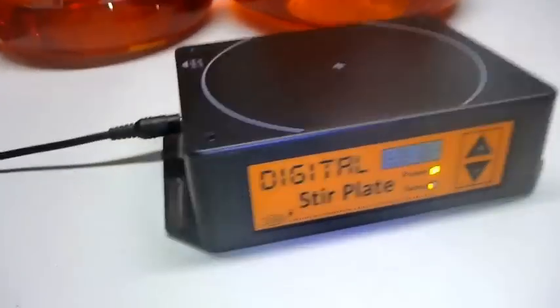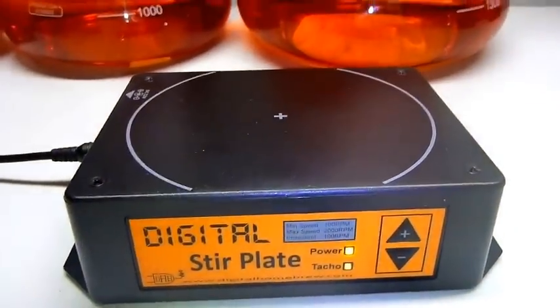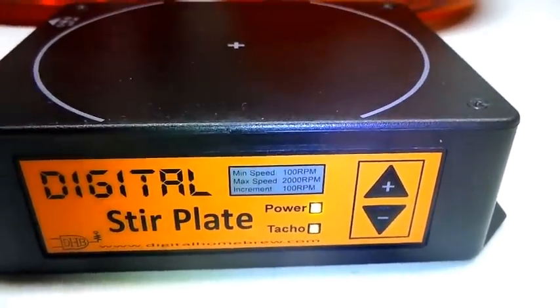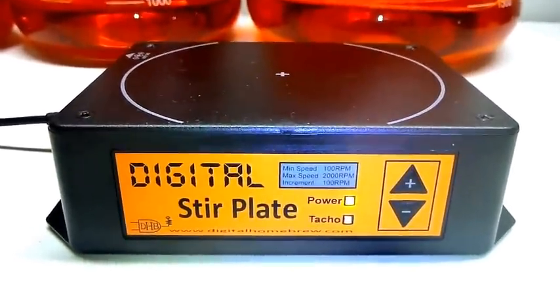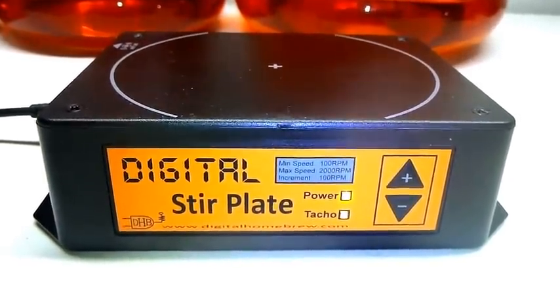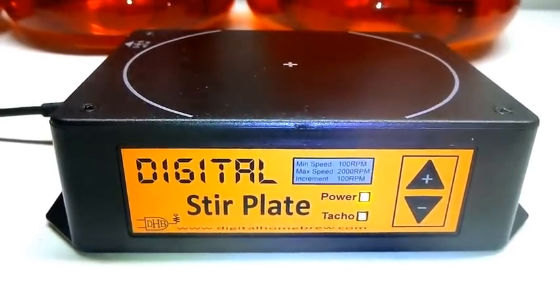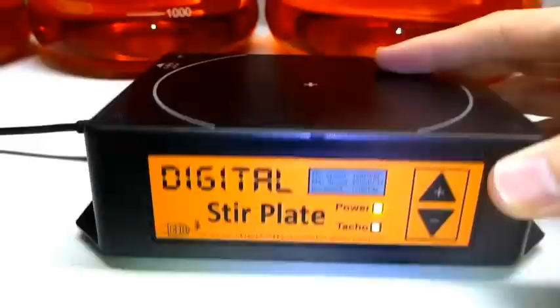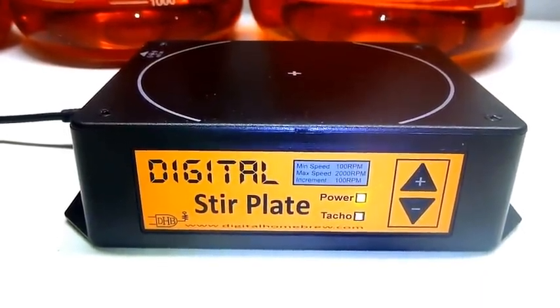We still have all of our old features — we have the mounting flanges on the side so you can mount it to your brewing bench, the splash-proof front panel, digital controls, tachometer, and LED. It's designed and assembled in Australia and of course it comes with our no-BS warranty, same as the old ones — if anything goes wrong just let us know. We're more than happy to help you out; if we can't help you we'll replace it, repair it, or if worse comes to worst we'll give you your money back. If you're interested and can think of a use for a digital stir plate in your brew shed, head on over to www.digitalhomebrew.com and check them out before they go out of stock again.